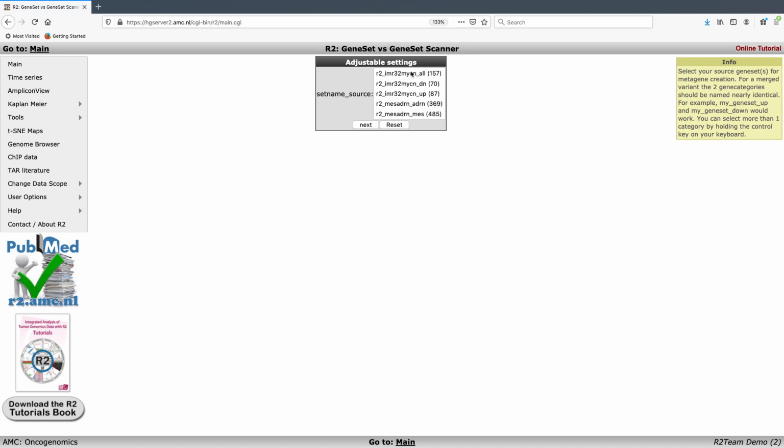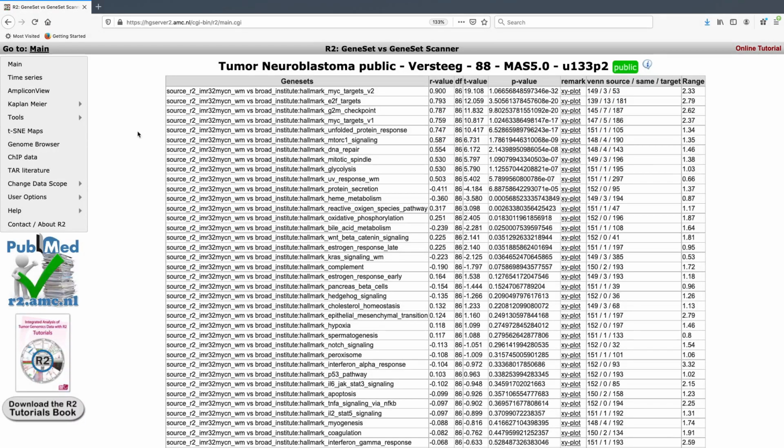And now you can see again that we have the option of selecting a subset of our gene signatures, and we are again going to select both the up and the down together in order for it to calculate a signature score the same way that we have done previously, and click Next. So because we have provided both an up and down regulated gene list as an input, it does calculate the weighted signature score as we described before using the Geneset view.